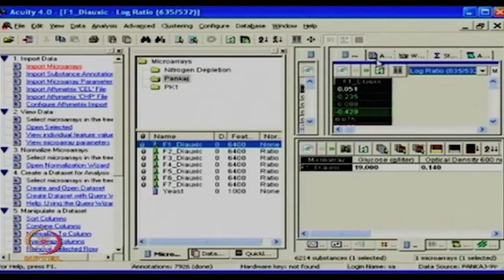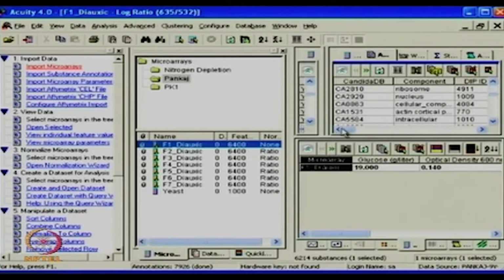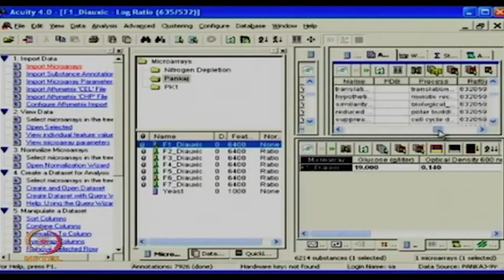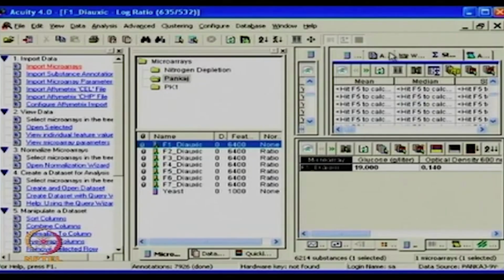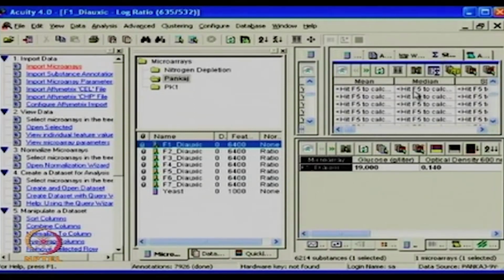Apart from this, the other tab includes the annotation, which gives you what all different ones are tracing, at the level of annotation names in the form of different databases, information on the genes or how the protein is behaving, or even the localization, so where it is being localized, all that can be traced. And it also gives a little bit of other details in the form of statistics, warehouses, and a few of the auto scripting capability which advanced users sometimes want to use. But this particular statistic will allow you to see what all you want to see, which we see in detail.